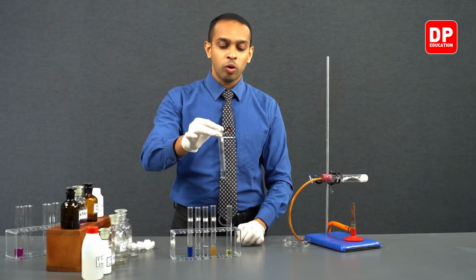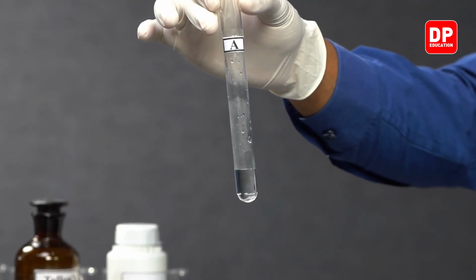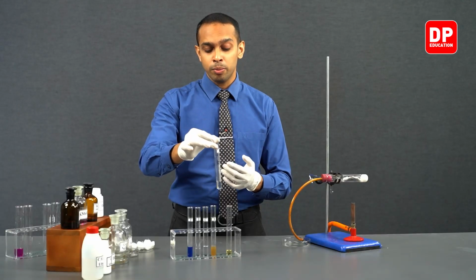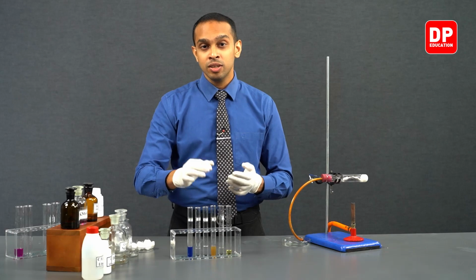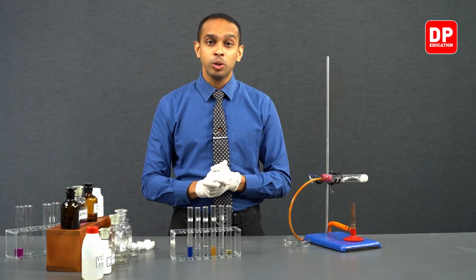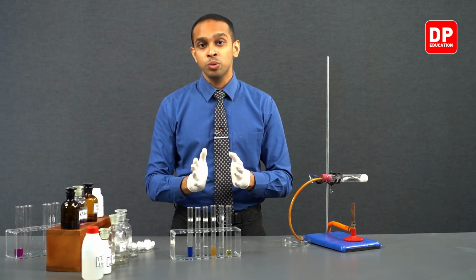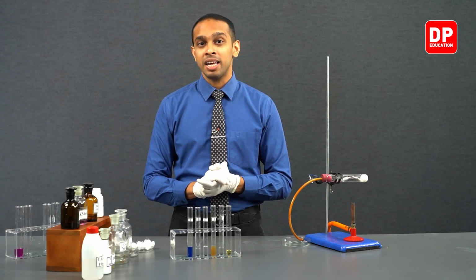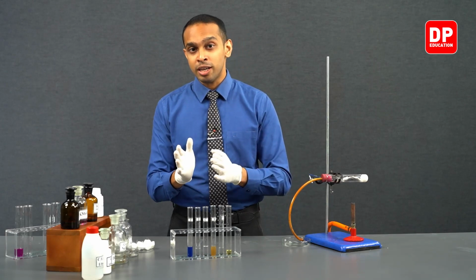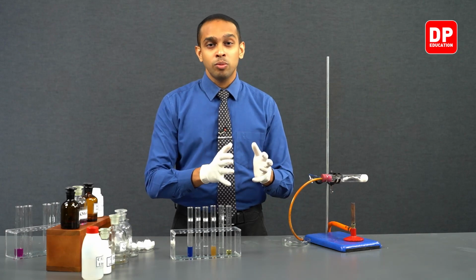Now students, you can see the initial color of bromine water was yellow or yellow brown in color. However, after we sent ethene gas through the bromine water, we can see that the bromine water has gotten decolorized. Why did the bromine water get decolorized, students? When bromine comes into contact with ethene gas, due to the double bond that is present in ethene, bromine molecules will get added onto the ethene molecule to produce 1,2-dibromoethane.